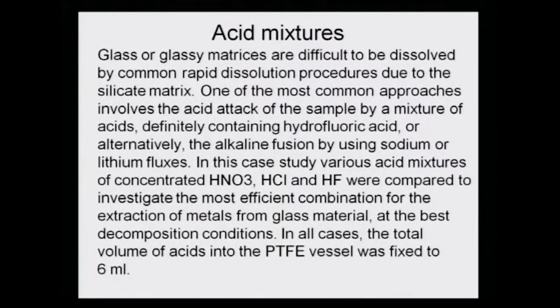That is why hydrofluoric acid was introduced. But the problem of using hydrofluoric acid is that it cannot be used in glass beakers, because glasses are again made up of silicate, and silicates react with hydrofluoric acid. It will digest the beaker also and the sample also. So, that is why Teflon vessels were brought into the picture. And when it was investigated which combination of extraction was most efficient, it was found that the best decomposition conditions were when all three are used together.